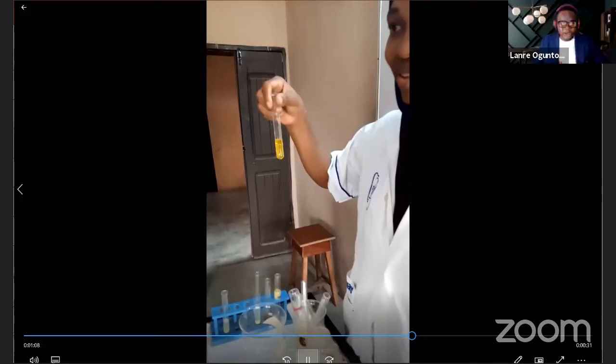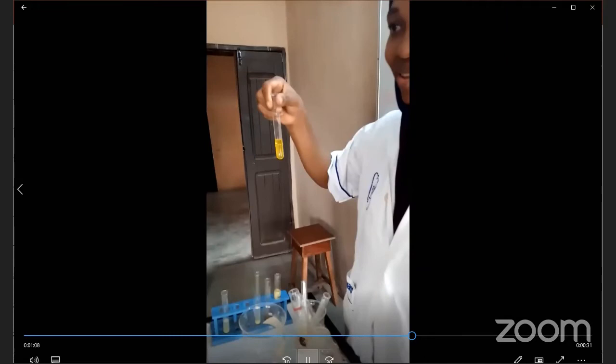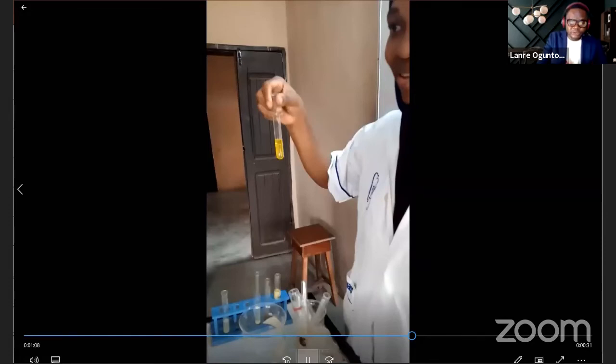Sample D plus water, what do you think will be your observation in case you are asked to dissolve your sample D in water? So in case you are asked to dissolve, what do you write? Solid is slightly soluble, or insoluble if you like. So you tell them that your inference is that solid is insoluble in water. Okay, that's your inference. Solid is insoluble in water. Everybody be writing your table down.